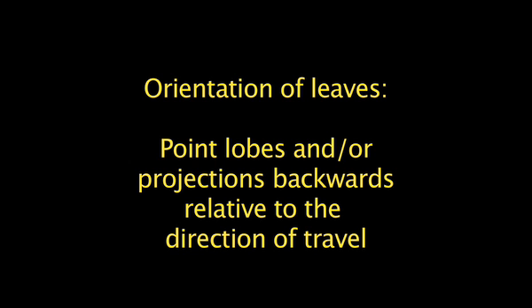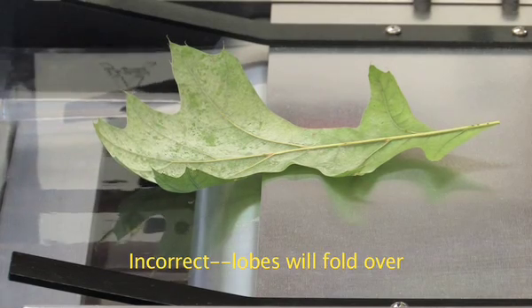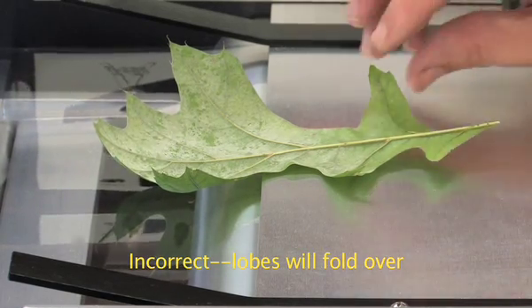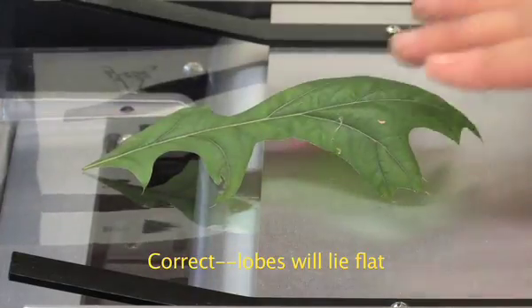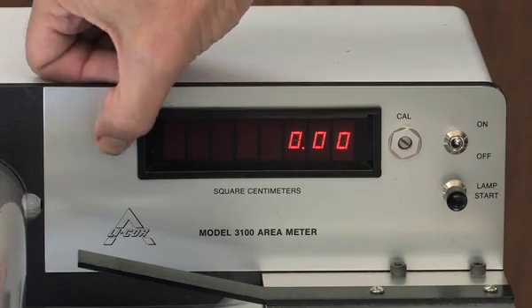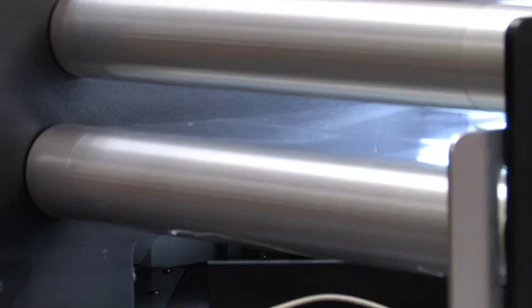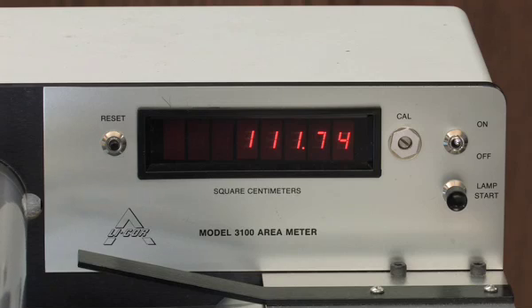Measurement of blade area is quite simple and primarily involves placing a leaf on the conveyor system and recording the value. Orient leaves with their lobes pointing away from the direction of travel. Otherwise, the lobes may fold over when traveling through the conveyor belt system. Reset the display before the leaf enters the conveyor system. After the leaf has passed through the meter, record the value and go on to the next leaf.